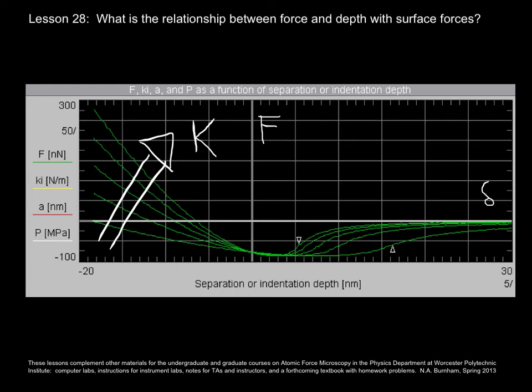What's interesting to me is that this also happens on the right-hand side of the plot, but now the orientation of the increased force is different. These points along this level correspond to minus pi tip radius work of adhesion.